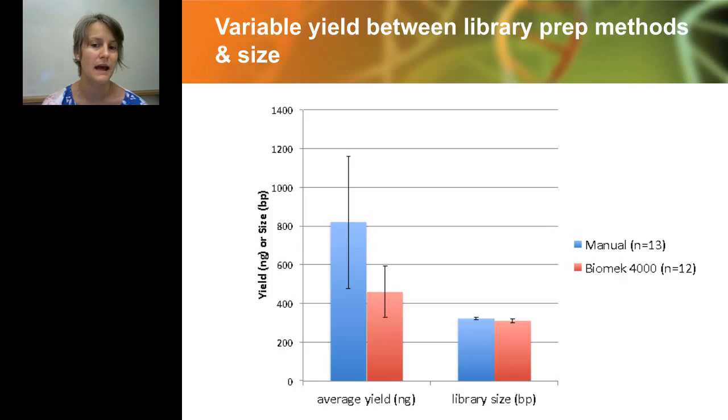Whereas when that happens on the Beckman, there may be a little bit of leftover, 1 or 2 microliters in each of the reaction steps. And as you do that over 4 or 5 different parts of the protocol, you may lose a little bit of material. But again, it's plenty of material to sequence.